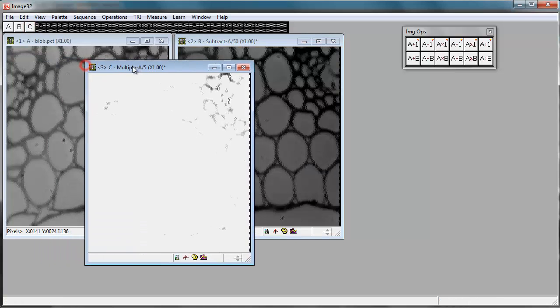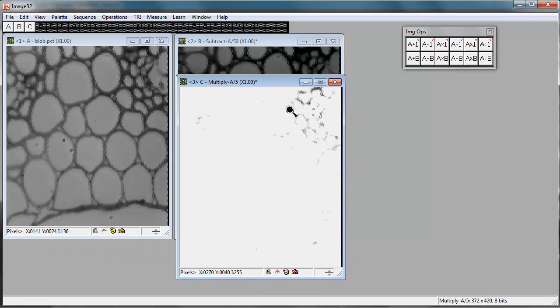And what we can now see is that the image itself has become totally saturated. This is because we've only got 8 bits worth of data. We can tell it's only got 8 bits of data by looking in the lower bottom right hand corner. We see that there isn't any display translation associated with 16 and 32-bit images.